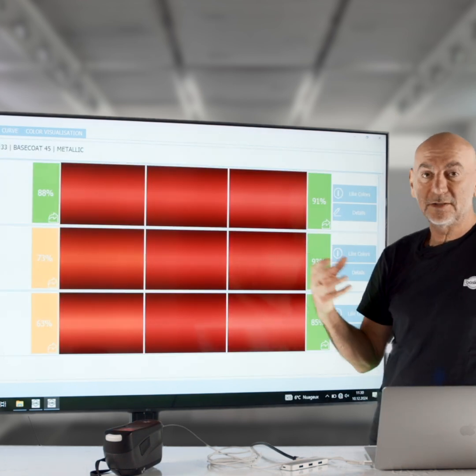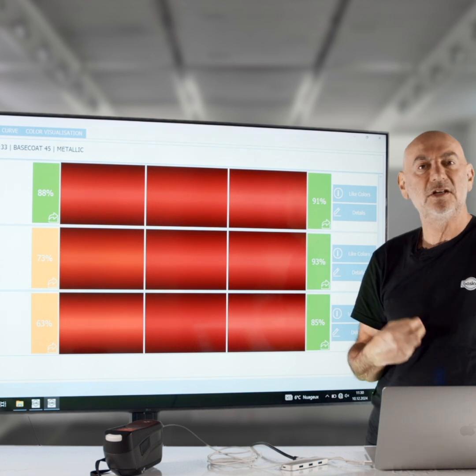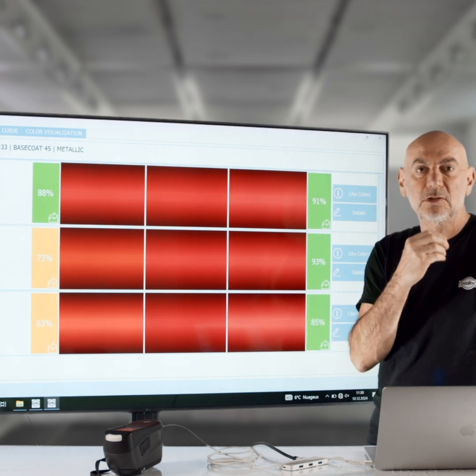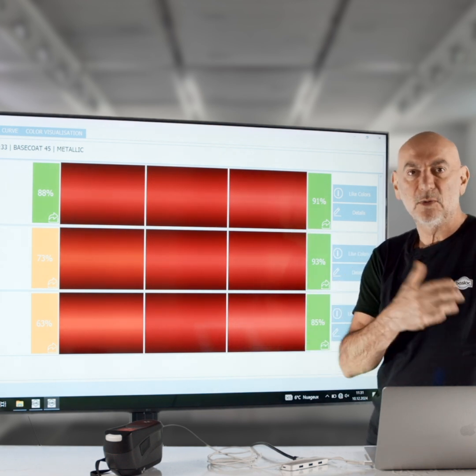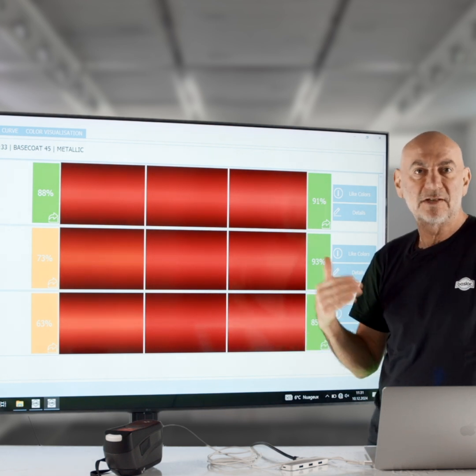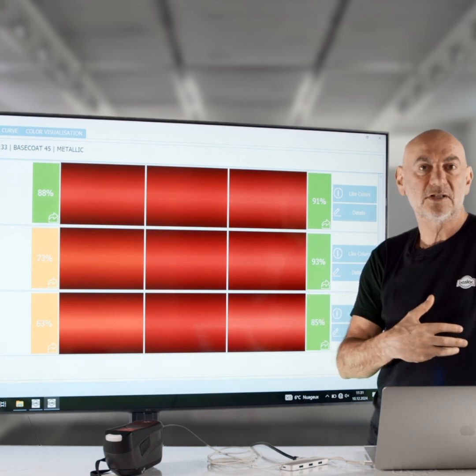I hope you enjoyed it. The color curve is not something that you can explain very easily in a few minutes. I just gave you the highlights and the things that we absolutely want to look for when analyzing a color curve. Nevertheless, if you have any questions about color reading or analyzing, or if you have examples, put them in the chat and I will try to answer in the next movie.